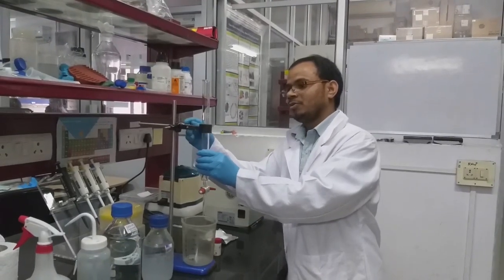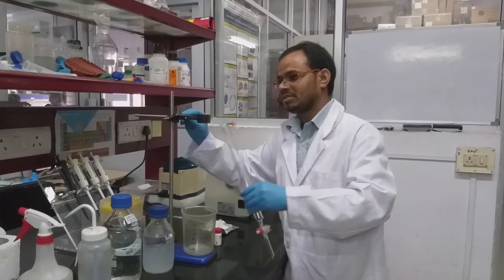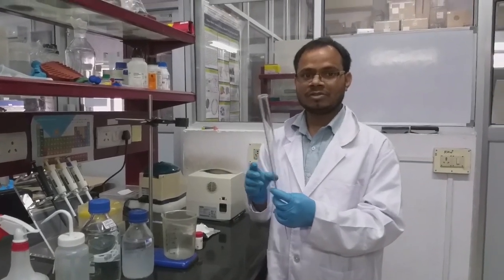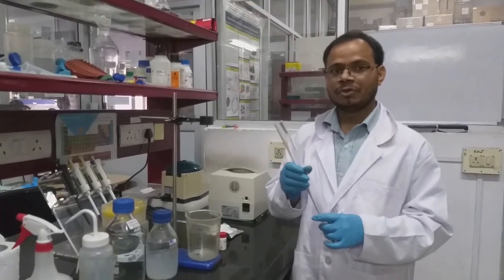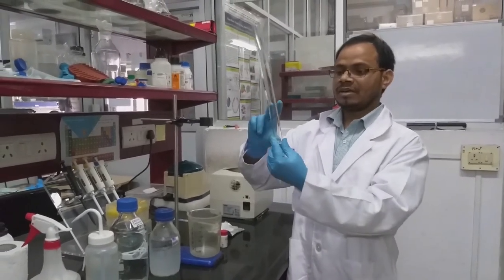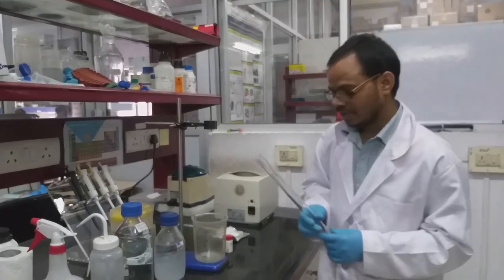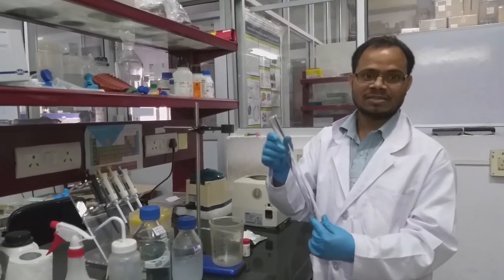For this chromatography we can use a burette or a column. This is one of the columns we are using in this experiment. For the resolution of molecules, if you are using 10 kDa, 20, 30, 40, 50 kDa proteins, in this case you need to increase the length of the column. That will improve the resolution of the molecules. Otherwise, if you use a small length like this, then the resolution is improper. You can get one fraction, and the other protein you will get together. So here we are using this. It is sufficient to elute one small size and another large size molecule.